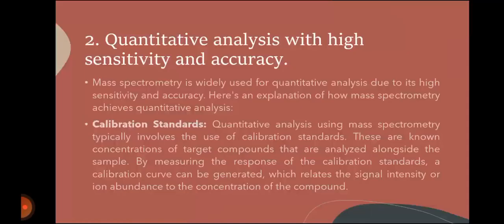Quantitative analysis with high sensitivity and accuracy. Mass spectrometry is widely used for quantitative analysis due to its high sensitivity and accuracy. Here's an explanation of how mass spectrometry achieves quantitative analysis.